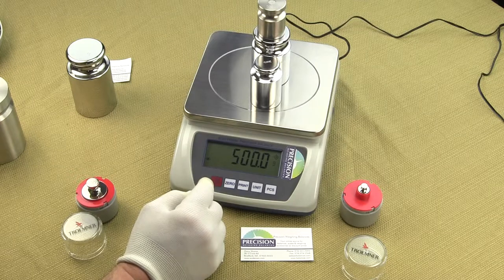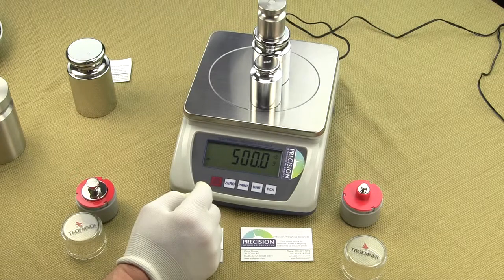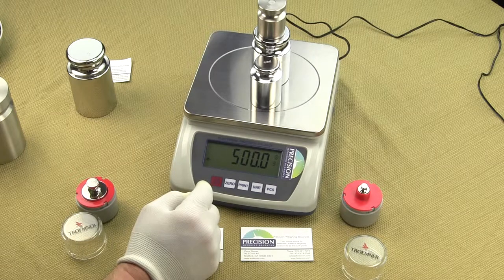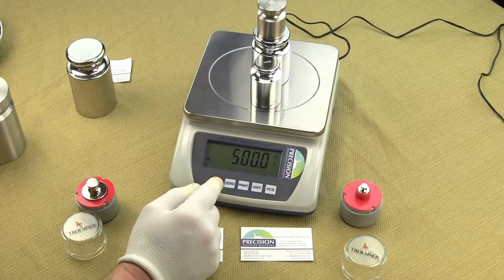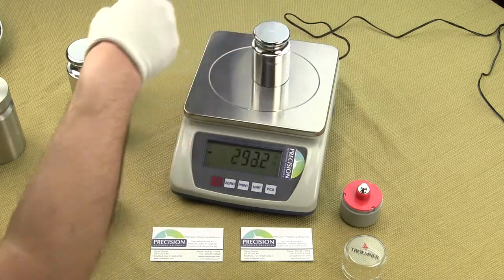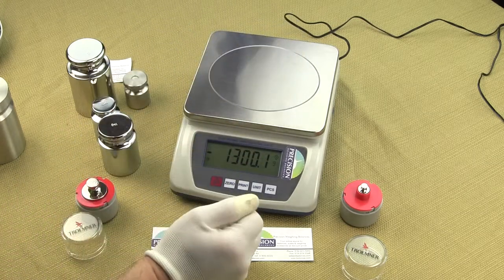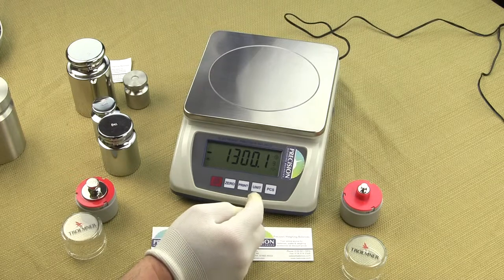These EPB scales offer outstanding value. The scale is made in China, no different than comparable models like A&D's EJ and EK series which are made in Korea, or Ohaus's Scout and Adam Equipment's HCB series which are made in China. Calibration is simple but does require the purchase of optional calibration weights, which is similar to other manufacturers — they do require you to buy weights as they're not provided.